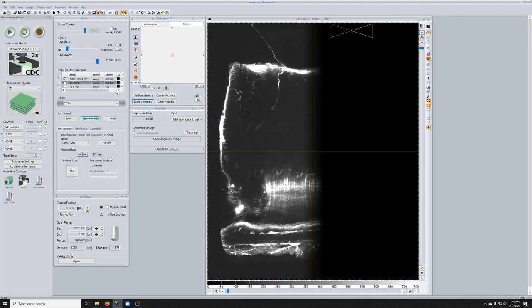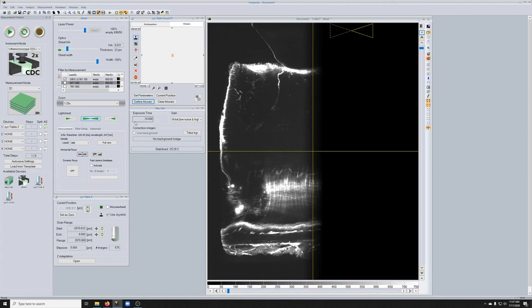Before you start a Z-Stack, figure out what exposure time you would want with a laser of 10%, and then flip it so that this is as small as possible. It's as close to 10 milliseconds as you can, and just increase the laser power.